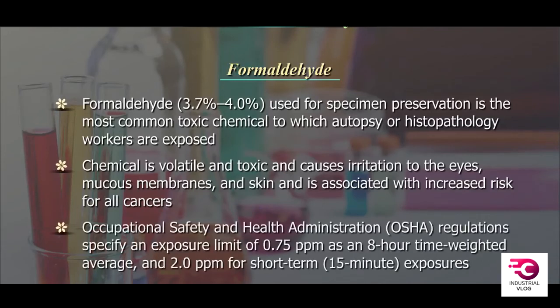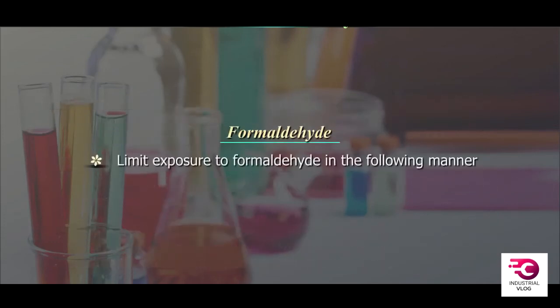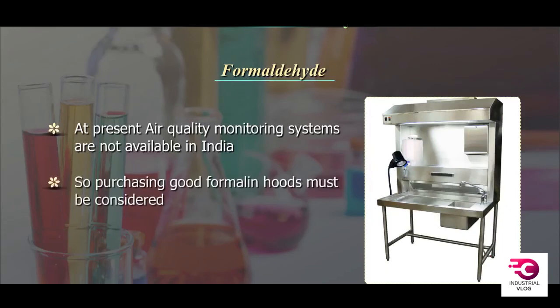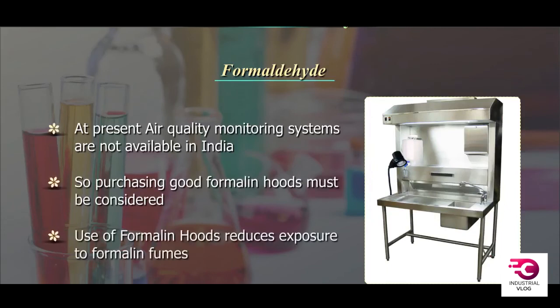Occupational Safety and Health Administration, that is OSHA, regulations specify an exposure limit of 0.75 parts per million as an 8-hour time-weighted average and 2 parts per million for short-term, that is 15-minute exposures. Limit exposure to formaldehyde in the following manner. At present, air quality monitoring systems are not available in India, so purchasing good formalin hoods must be considered. The use of formalin hoods reduces exposure to formalin fumes.